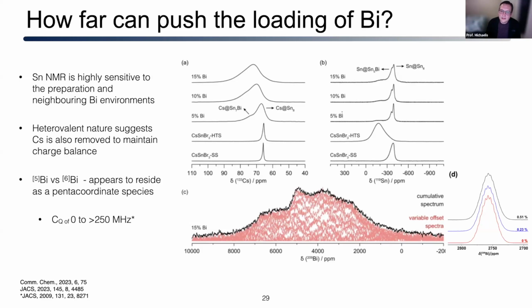And then the other one that would be different is when we did the germanium data, our tuning frequency on the 800 was around 27, 28 megahertz. So you'd have to get a low gamma probe. And I won't say much more in case there are commercial representatives, but we had to argue to get that probe because they said the sensitivity would not be good enough. But it works out decently well in the end. So I hope that answers your question.